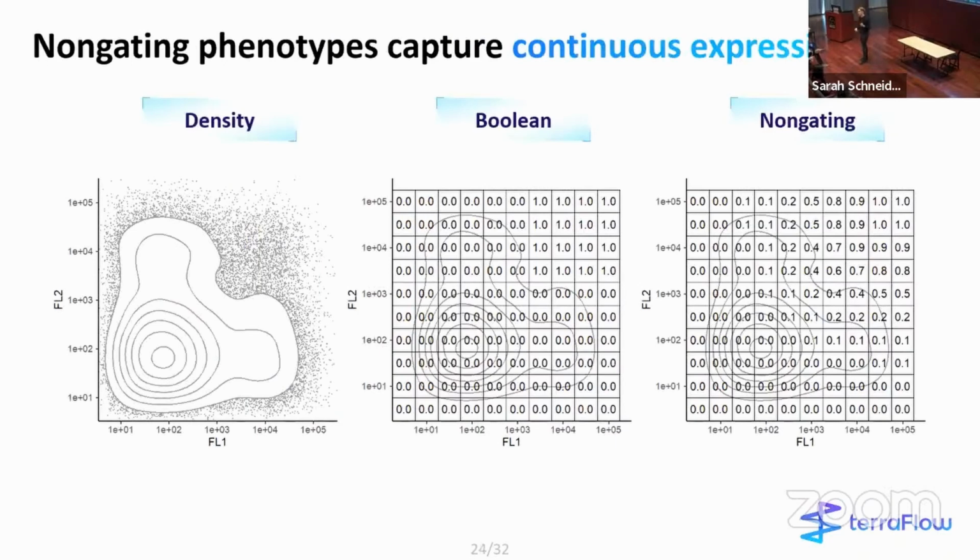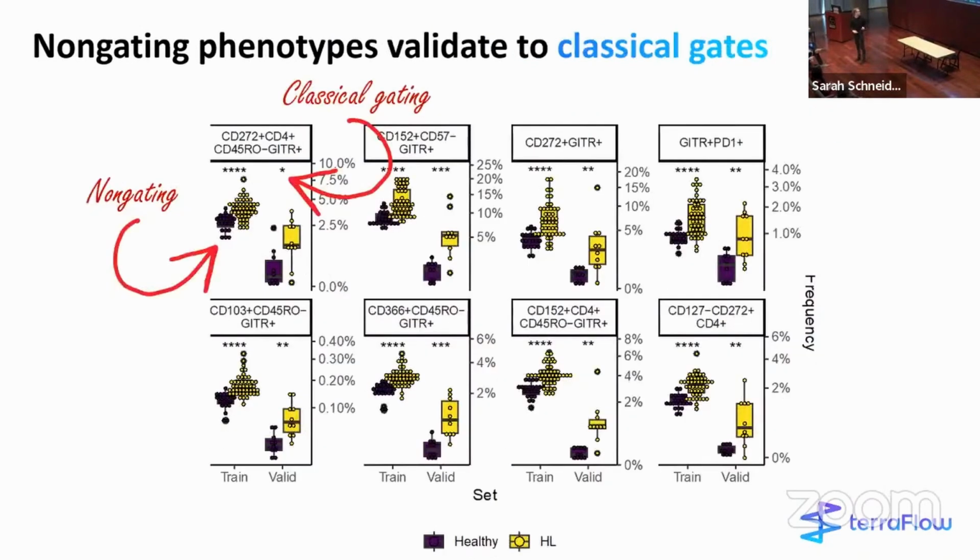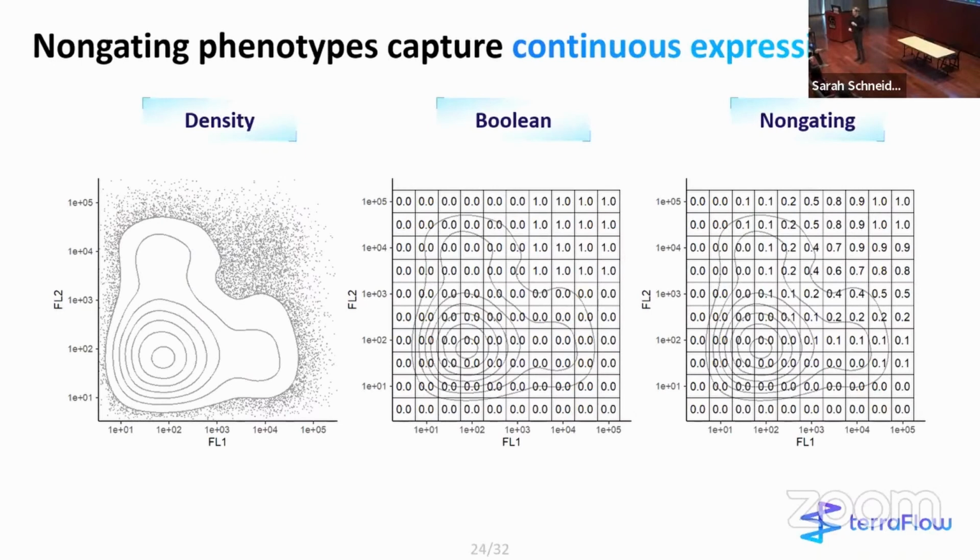In traditional flow cytometry gating, okay, time for your imagination again. In traditional flow cytometry gating, we draw a rectangle, and every cell inside that rectangle gets a value of 1. Every cell outside that gate gets a value of 0. And the average of all those 1s and 0s equals some percent positive, say 8% double positive. So you would see here, all the 1s would be red, all the 0s would be blue. It would be a binary.